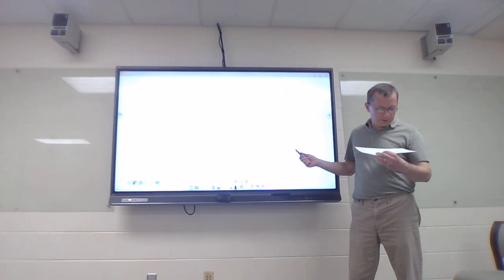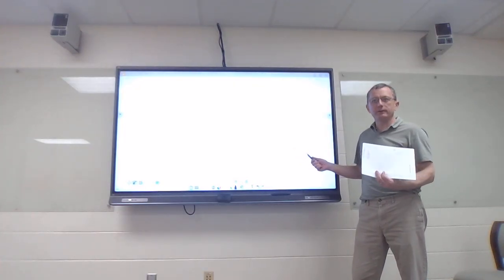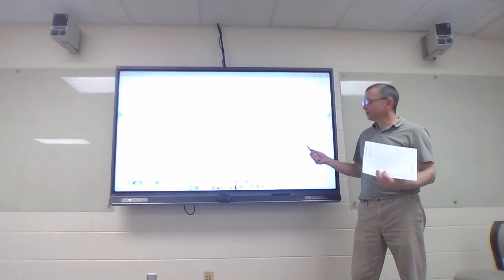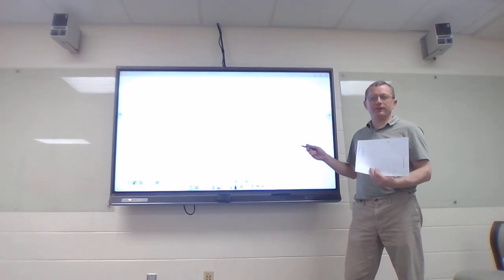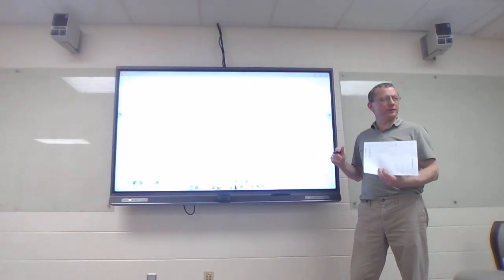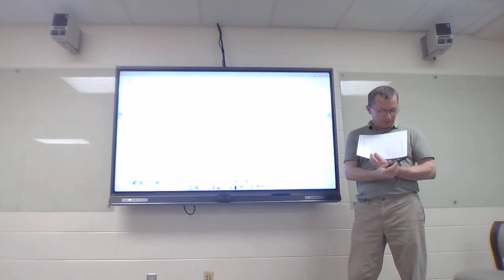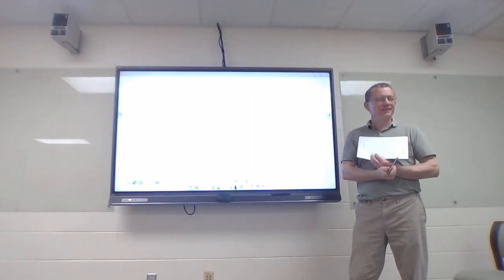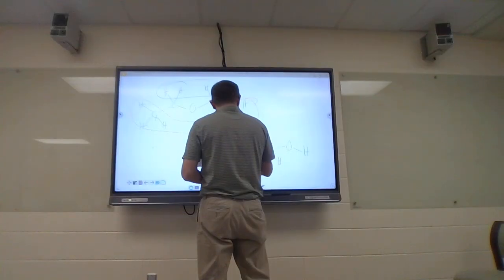Look at the next peak there at about 2.7, 2.8. You see that? It integrates to 1. Found it. Because now what am I left with? From that molecular formula, I need 1 more carbon and 3 hydrogens up here around 1, integrating to 3.